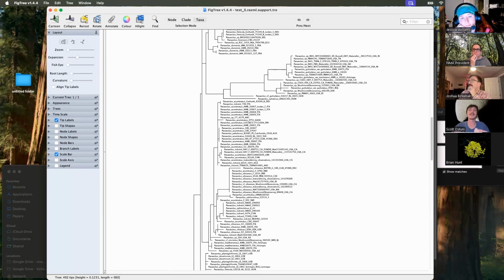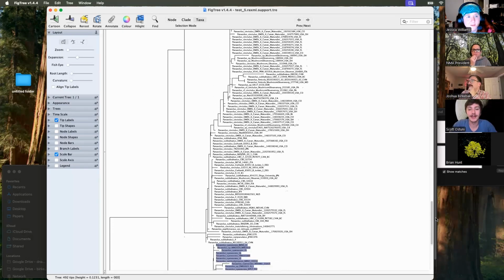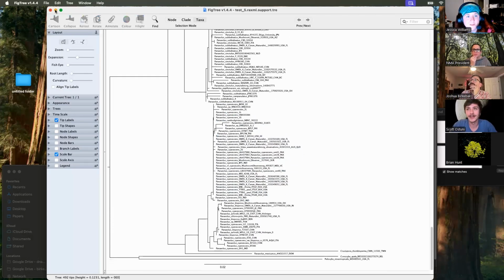All right, Josh, I have a question. Hypothetically, let's say somebody starts running nanopore on another gene region, like a protein coding region, and you see two distinct haplotypes. Would that be sufficient evidence for hybridization, do you think? Not necessarily. It depends on how different they are, right? And in what part, like intron versus exon. If they're in the introns, I'd just ignore them, more or less.